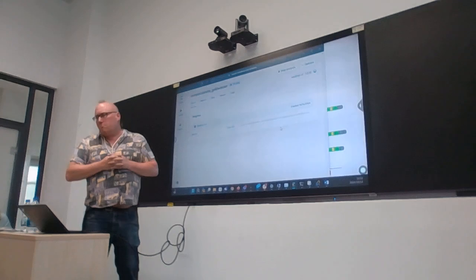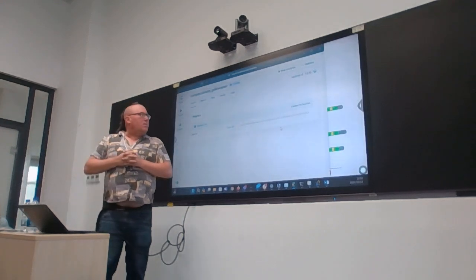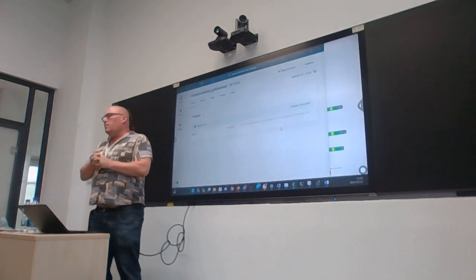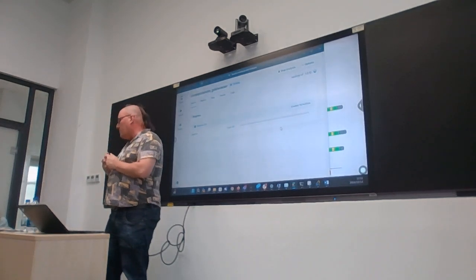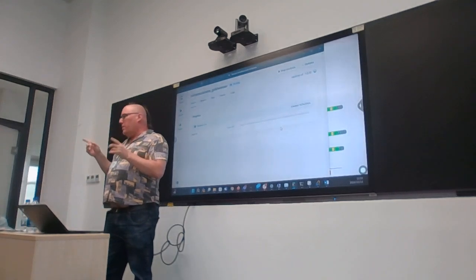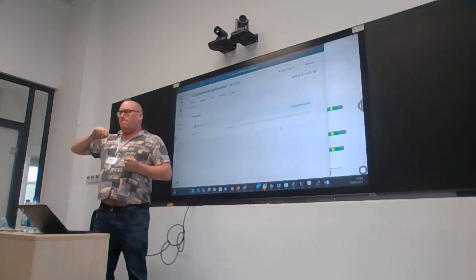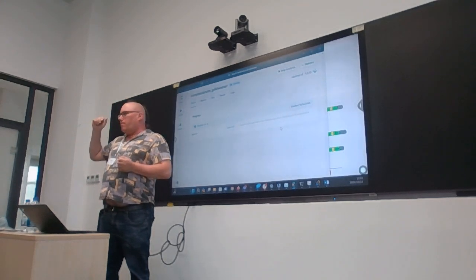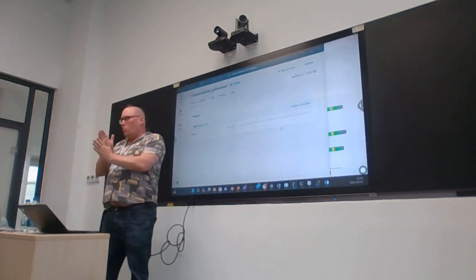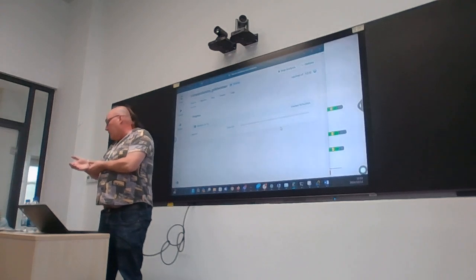So if you had to, in one sentence, describe the role of Squirrel. Squirrel has more than one role, which is why it's difficult to describe. One of the things it does is identify where the results of your other pipeline should maybe be masked, where your variant calls might be incorrect.